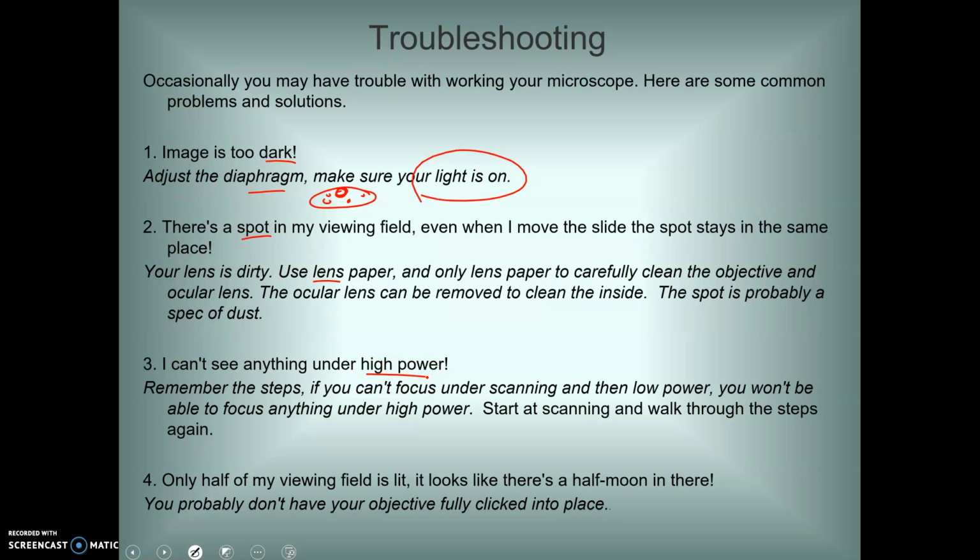High power, you can't see anything. Remember, in order to see on high power, your high power lens is going to end up like this, so close that it's almost touching your slide. So you don't want to start with high power. Definitely don't start with it. But if you start with scanning and you get to high power and your high power lens is basically here and then here's your stage and you see a big gap, I can guarantee you that's why you're not seeing anything. Because when you're close to being in focus with high power, that lens is almost touching the slide. So you want to start at scanning, work your way up.